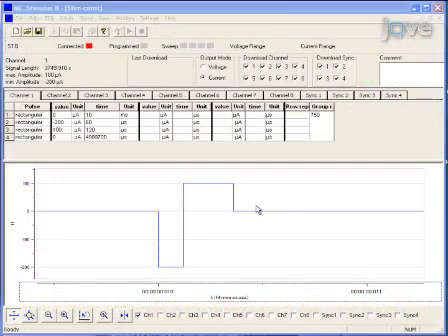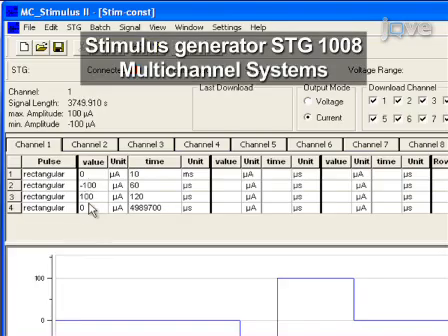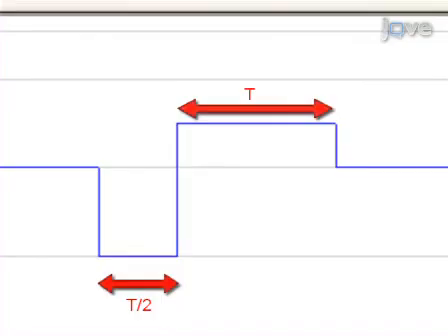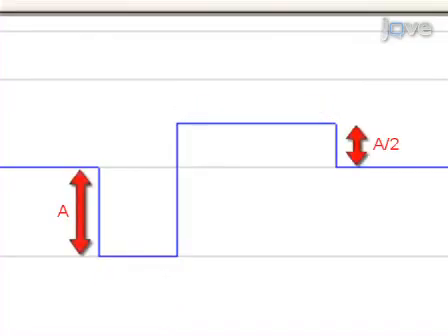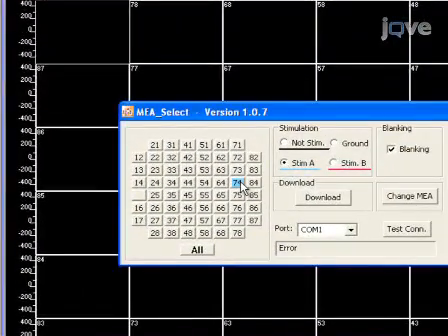To record stimulus-evoked activity, first, the temporal waveform and amplitude of stimuli are specified with software which controls a stimulus generator. A useful stimulation paradigm is the current-controlled charge-neutral single shock with bipolar square waveform. Next, an electrode is selected which will be used to deliver the stimuli.